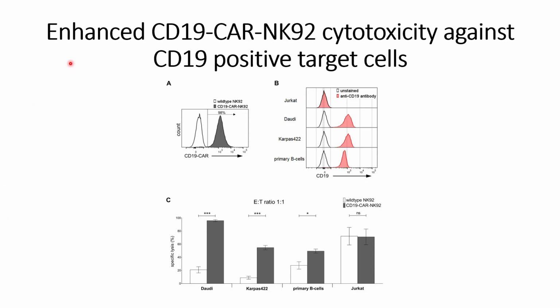In this video, we will discuss enhanced CD19-CAR-NK92 cytotoxicity against CD19 positive target cells. So basically, they will compare the cytotoxicity of these CD19 positive CAR-NK92 and the wild type NK92 cells. For this, they started with the wild type NK92 cells and then expressed CD19 CAR using lentivirus transductions, and they validated their lentivirus transductions using the flow cytometer results shown in panel A.